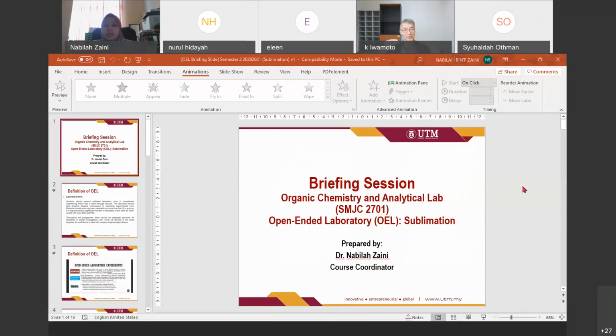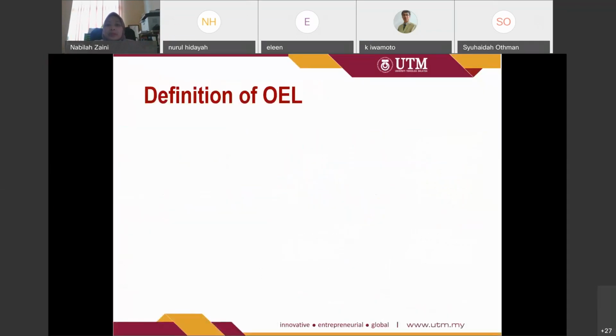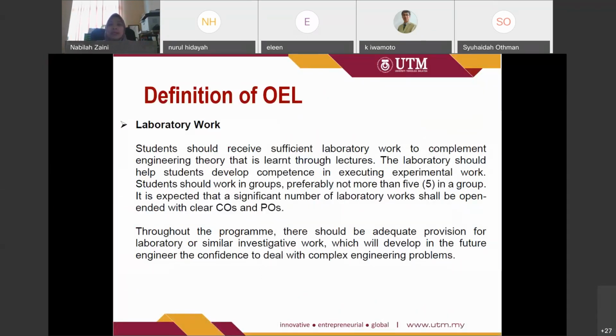So for today, we are going to conduct the briefing session on the open-ended laboratory, and we have chosen sublimation as the experiment to be conducted. So what is actually open-ended laboratory? Is my slide clear? What is actually OEL? The full name is open-ended laboratory.